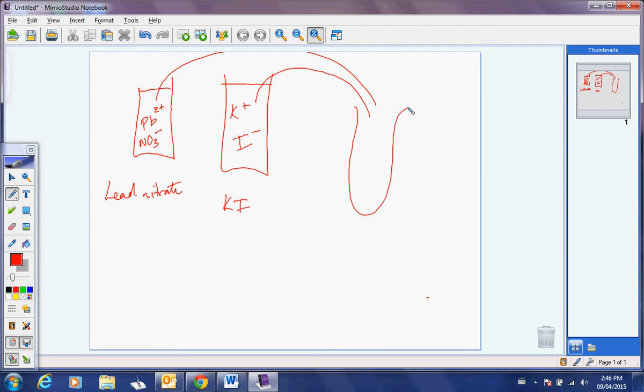So here we go. Some potassium iodide in the test tube. Everybody okay with that? What does it look like? Water. Describe it for me, please. Clear liquid. It's clear, meaning it's not cloudy. It's a liquid. And what color is it? Transparent. Clear. No, that's the light passing through it. That's what color?